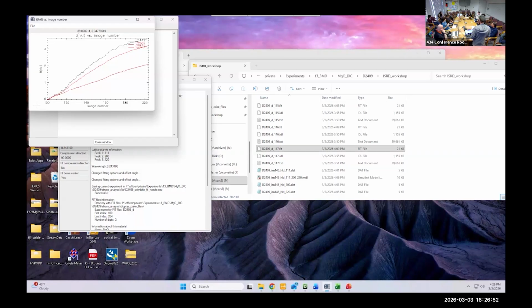Not really, because whatever peaks you have is determined by Bragg's law and the symmetry of your sample. You always get the same peaks when you repeat experiments. You don't get peaks that they're not supposed to show up from the crystals.